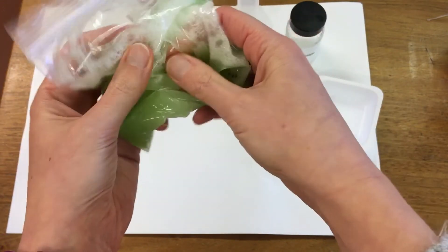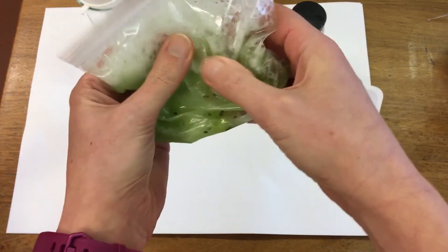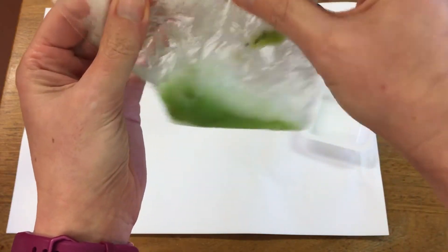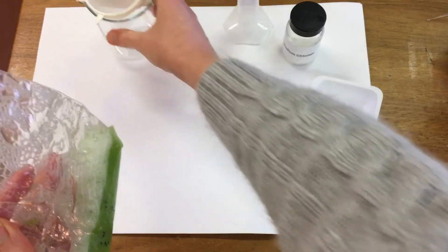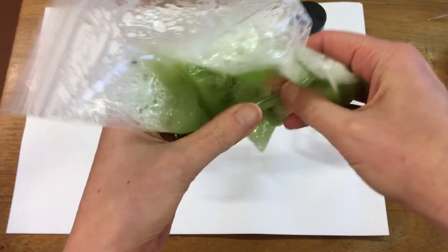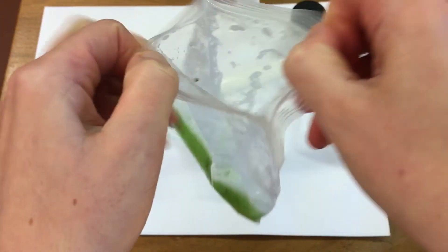Next we're going to filter our kiwi solution and try and extract the DNA. I'm going to filter it into a clean beaker to remove all the big lumps.